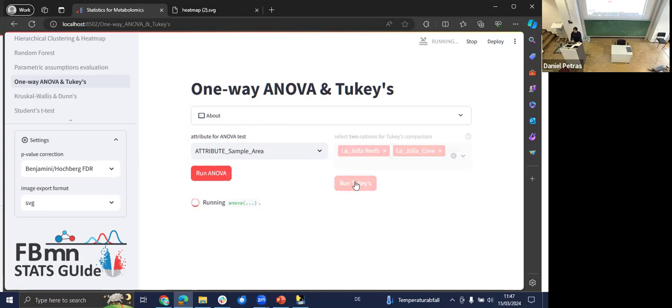And then what you see here, after the ANOVA test, are two options to look for comparison. Because with ANOVA tests, when you are going for multiple groups, even if one group is significantly different from the other group, it would call it a significant feature. So in order to make sure, you want to go further to know if it is really significant. This is what they call a post-hoc test, which we provide here as Tukey comparison. You could also do this with a t-test, which does pretty much the same thing, and you choose your two groups and you go for it.